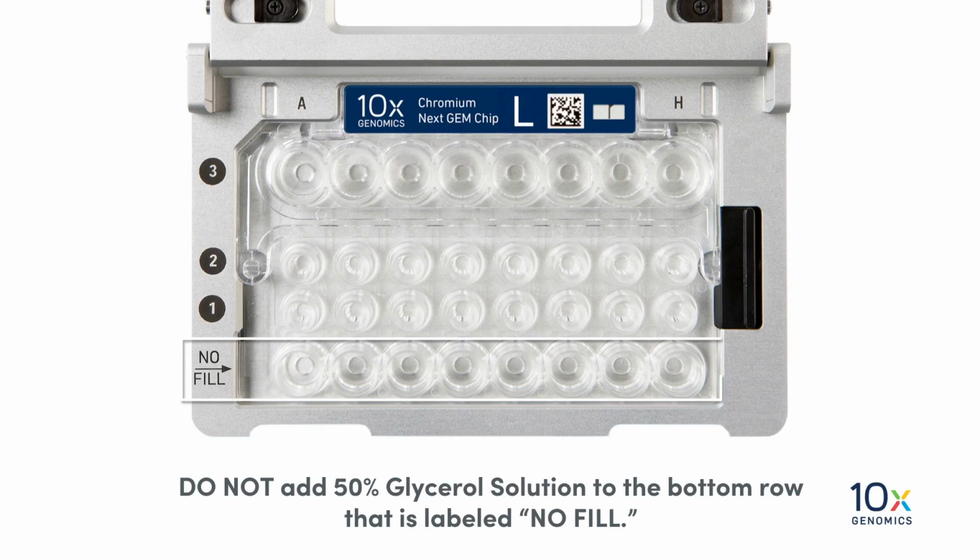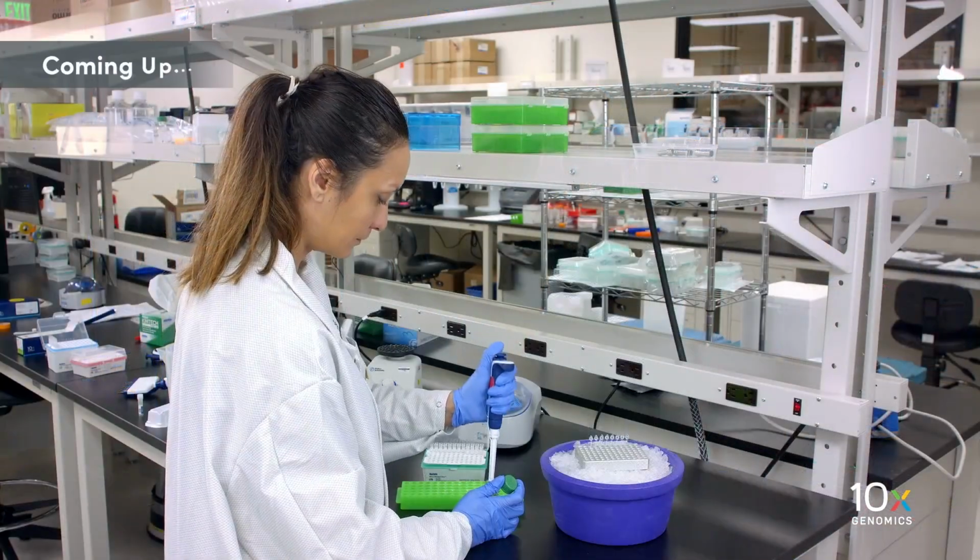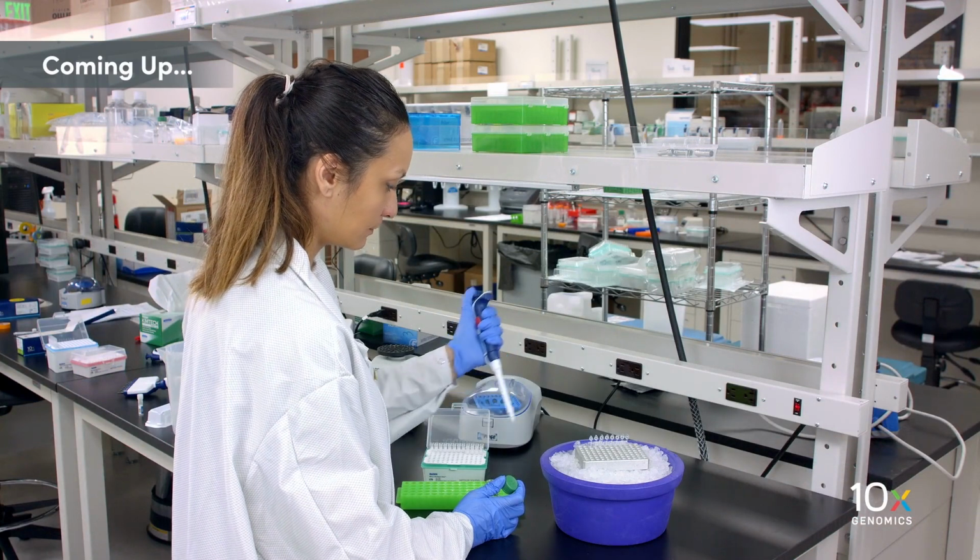Do not add 50% glycerol solution to the bottom row that is labeled no fill. Do not use any substitute for the 50% glycerol solution. We have loaded the 50% glycerol into the unused channels of the chip. Next, we're going to combine the master mix with water and single cell suspension.